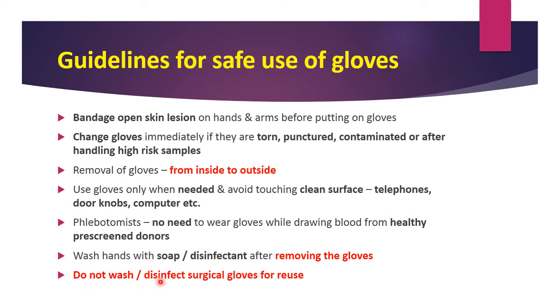Do not wash or disinfect surgical gloves for reuse. So don't reuse the gloves. They should always be disposable gloves, and don't wash or disinfect the surgical gloves for reuse. They should be just one-time use gloves.